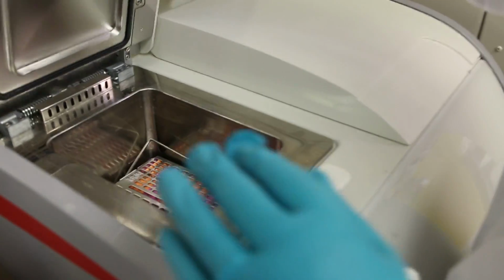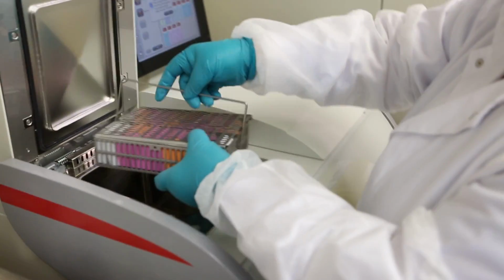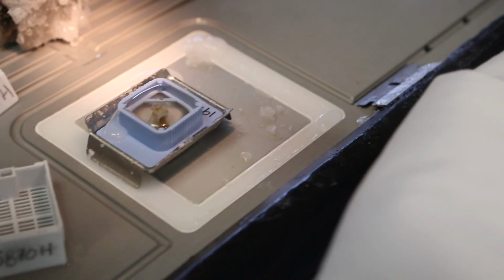The tissue processor is a fundamental piece of equipment for our laboratory. Why do we call it the heart of the lab? It's because it gives us the ability to process the tissue in its natural state to be able to study further disease, any kind of disease, whether it's Alzheimer's, MS, or any kind of changes that are at the cellular level and the molecular level. So we're able to identify those things. So it's paramount for us to process the tissue in the best manner possible, to give us the best research data that we need.